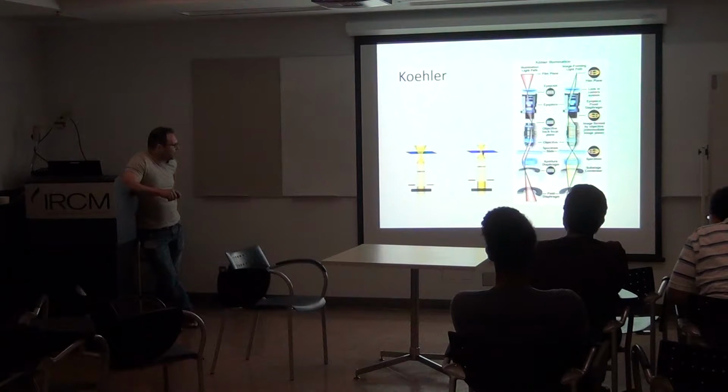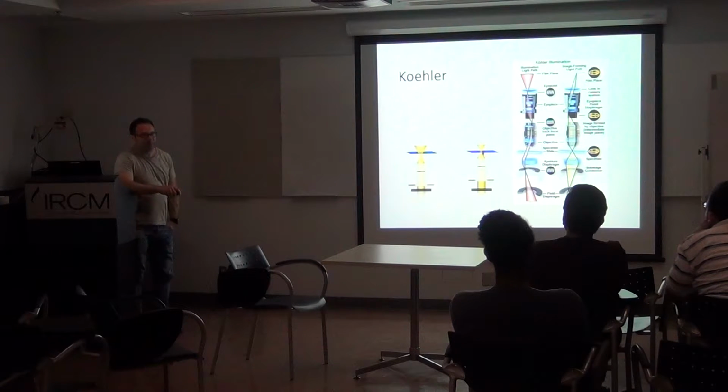So here it won't be adjusted the right way, because here you see that light is focused here while the specimen is there. This would be a nice adjustment, because this is where your specimen is positioned, so the objective would see at this focus range, and then you would focus the light at the same position.